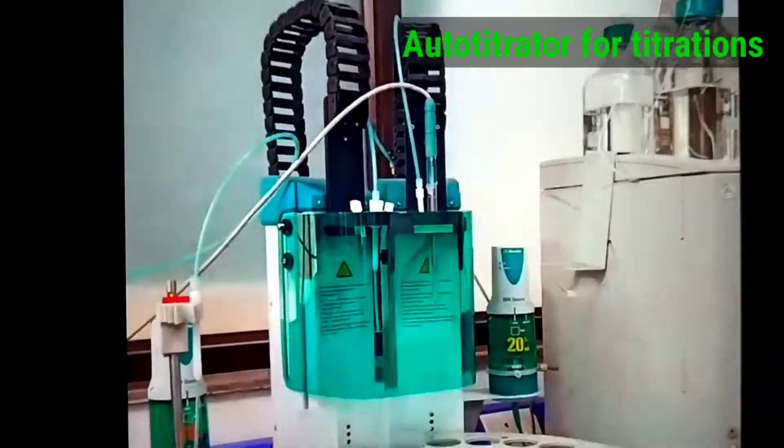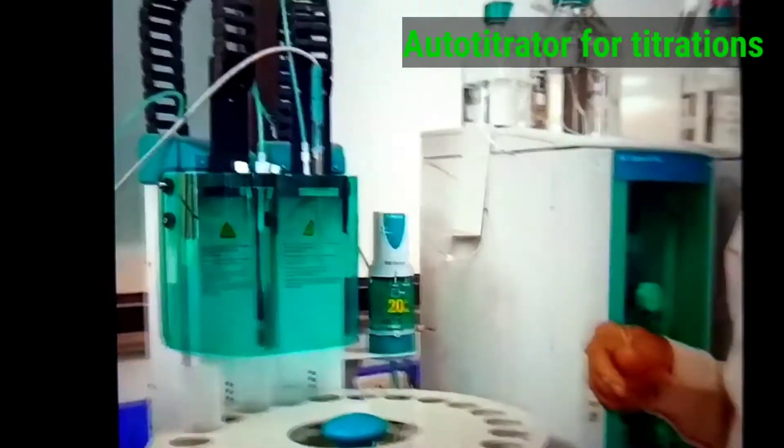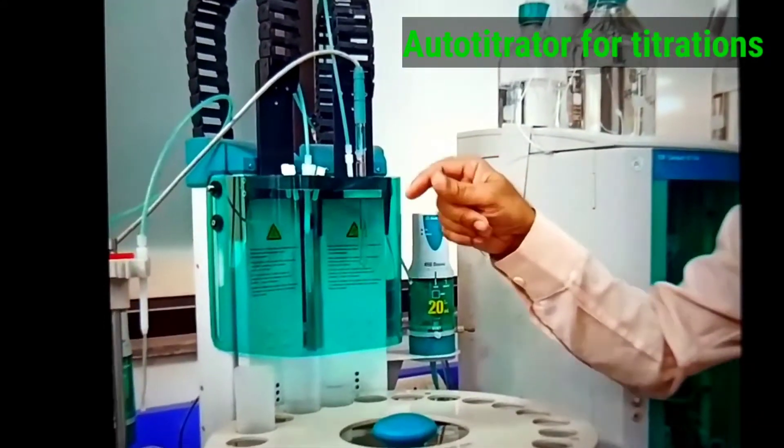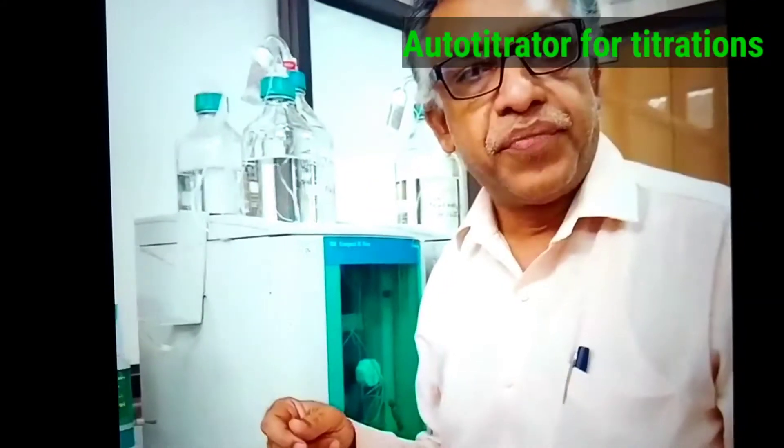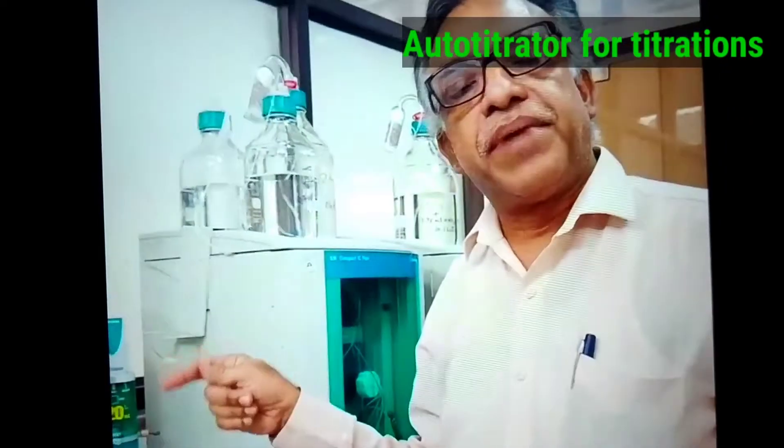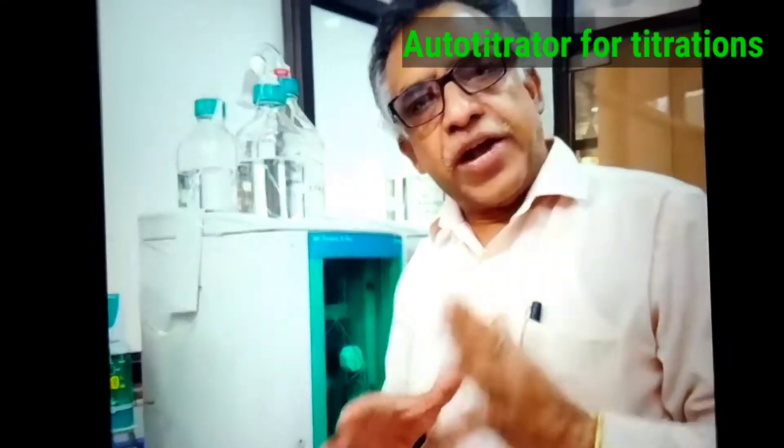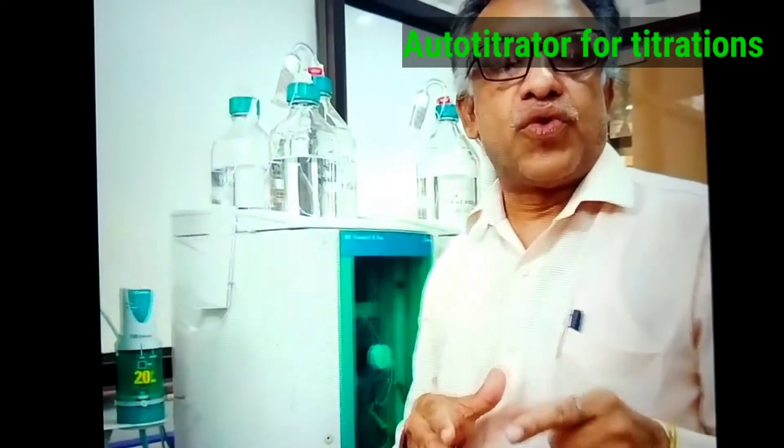So then it will again add this sulfuric acid into the sample, again drop by drop, till the pH comes down to 4.2. So in this fashion two endpoints will occur, and at the two points it will count how much acid has been consumed for getting the two endpoints.